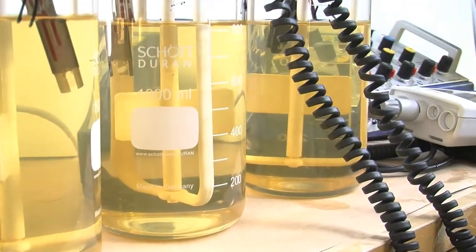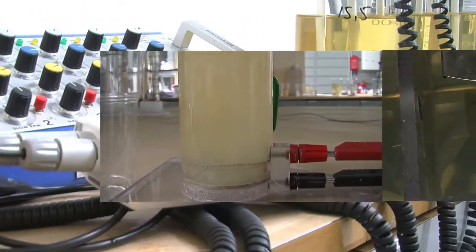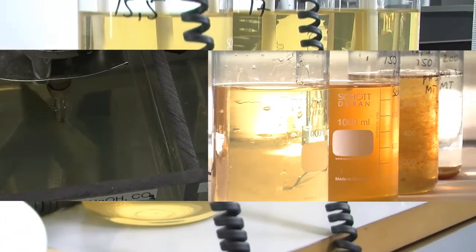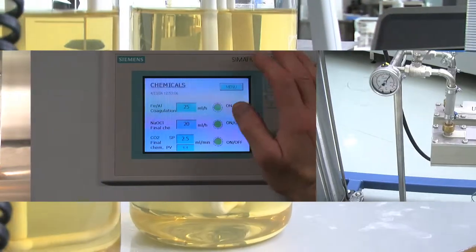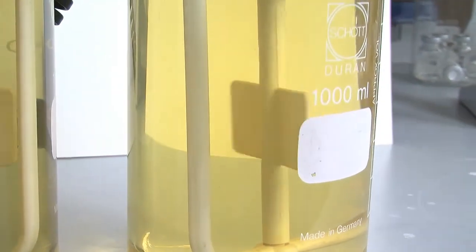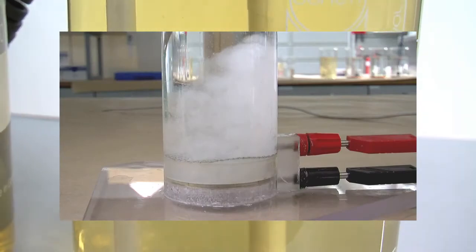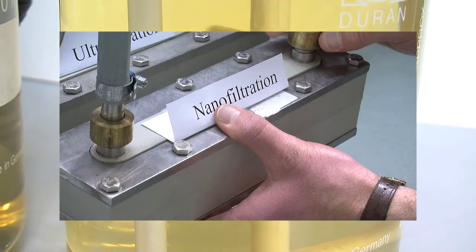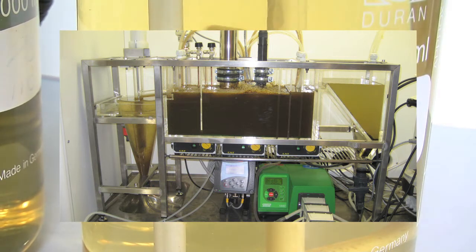In addition to ordinary jar test apparatus and the most common analytic facilities, we have a few laboratory and pilot-scale apparatuses that can be used to demonstrate the most common processes and operations on water and in wastewater treatment. In this presentation, we'll introduce our pilot-scale waterworks, benchtop electroflotation cell, pilot-scale membrane filtration unit, and benchtop wastewater treatment plant based on the activated sludge process.